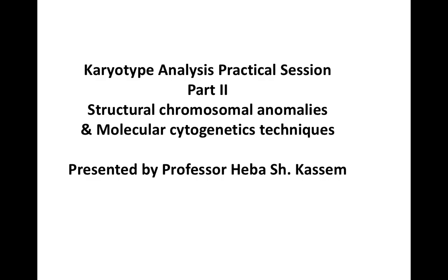Hello, we're back to the practical class part 2 on karyotype analysis, and we will be discussing in this session the description of the structural chromosomal anomalies through the karyotype analysis and the second method for chromosome study using molecular cytogenetics techniques.